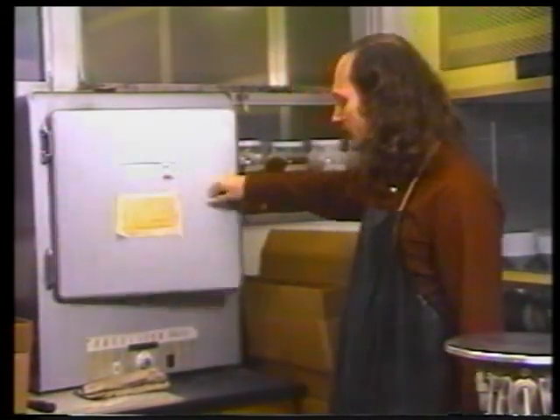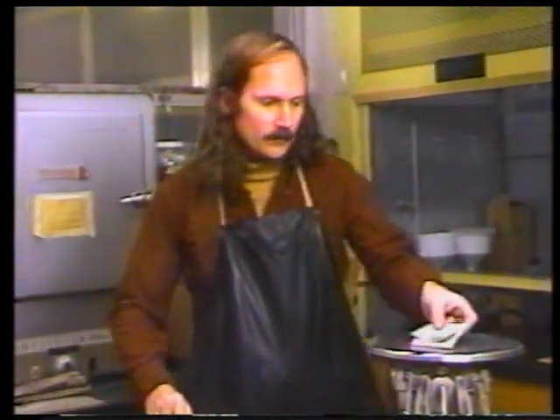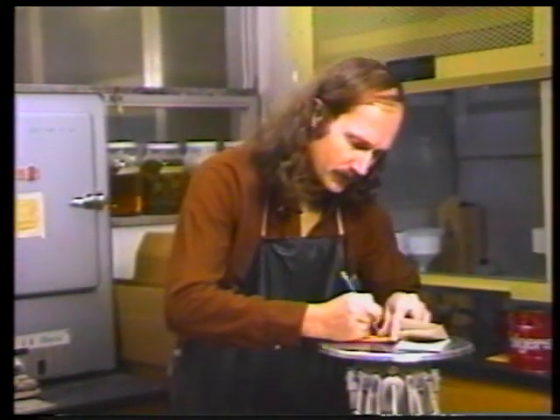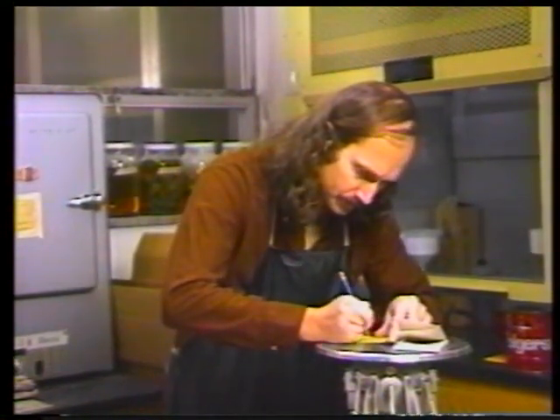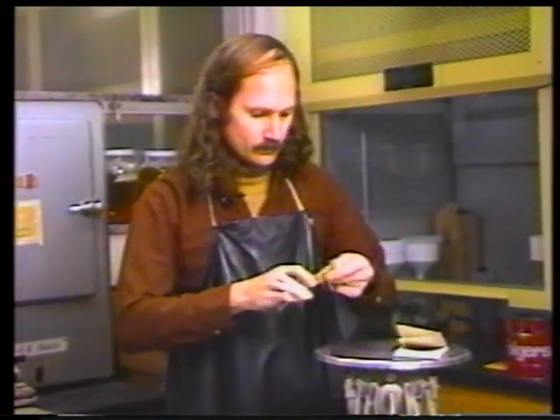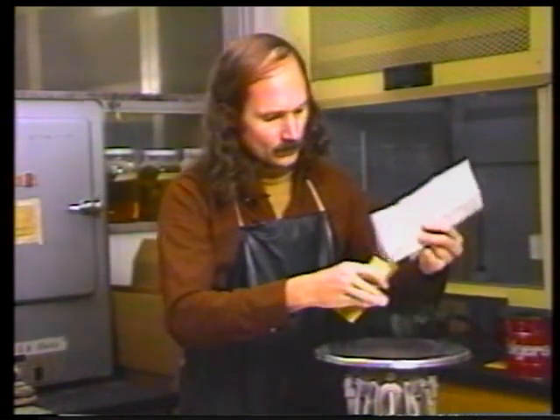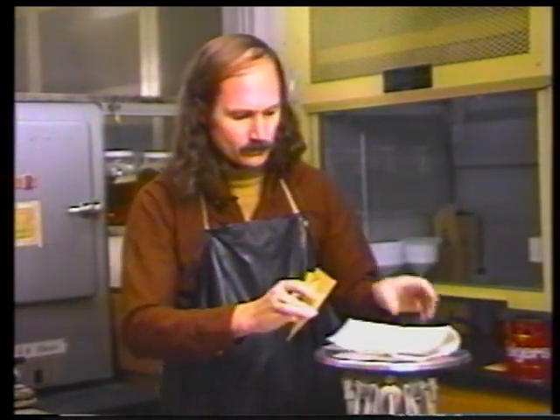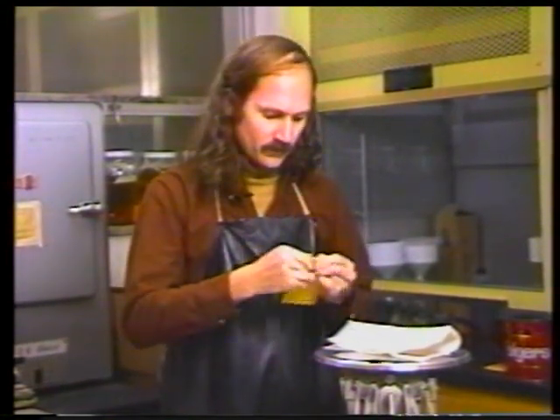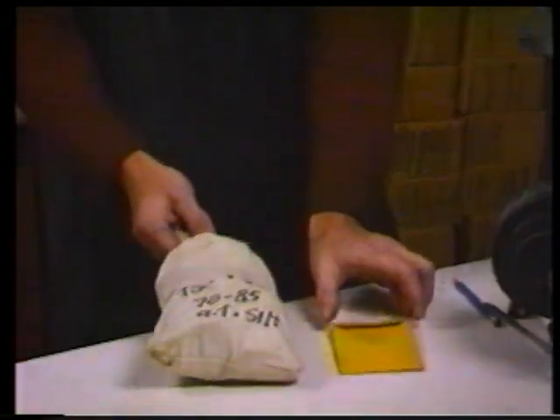When the sample is dried, it's ready to be transferred from the oven into a sample envelope. The information recorded on the filter paper is transferred to the envelope. The filter paper is opened up and the residue is poured into the envelope, which can then be stored until it's ready for picking. The techniques just demonstrated are used daily in the micropaleontological processing laboratories in the geology department at the University of Iowa. These techniques can also be used by your students in your classrooms.